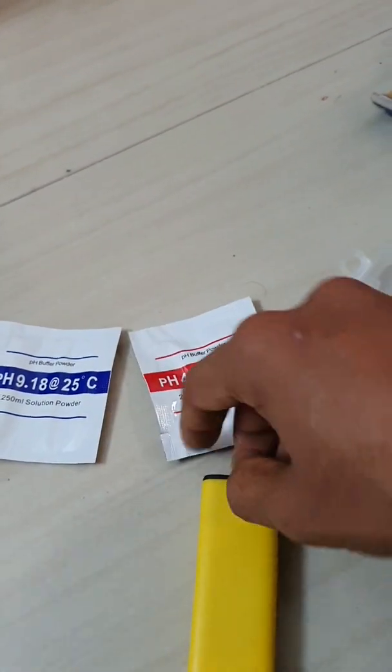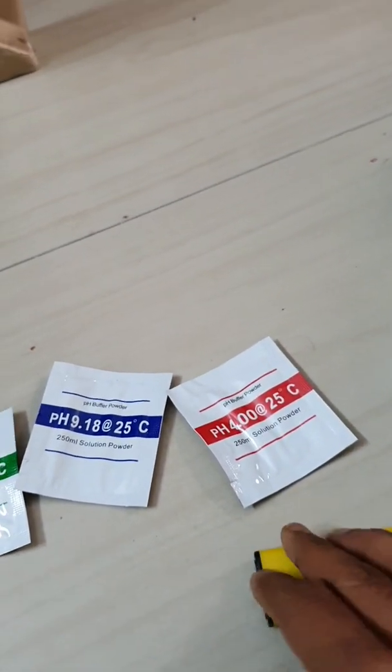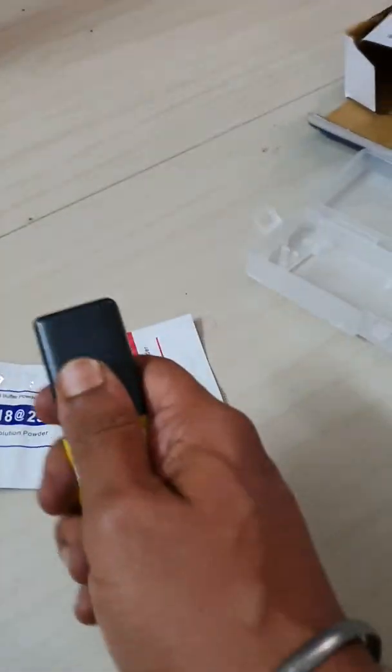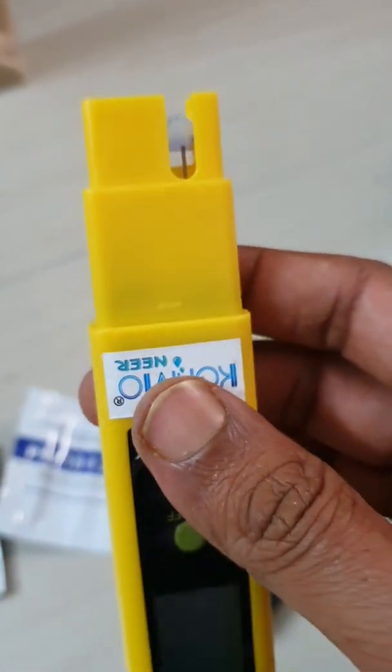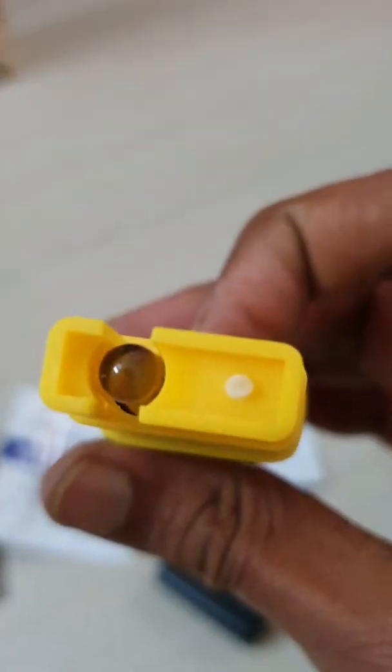We have the battery chamber right over here — it's pretty tight. This is the meter. You need to dip this probe and make sure you clean it with distilled water every time you use it, even during calibration.